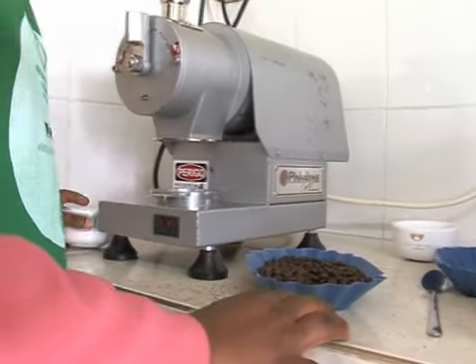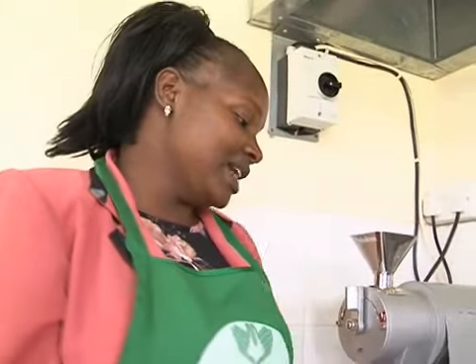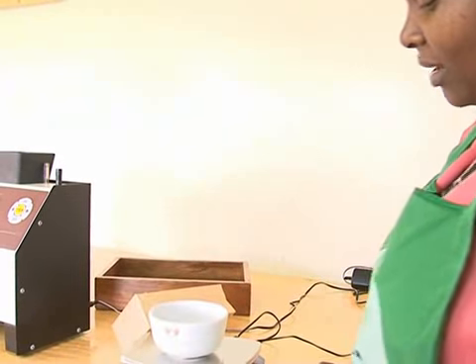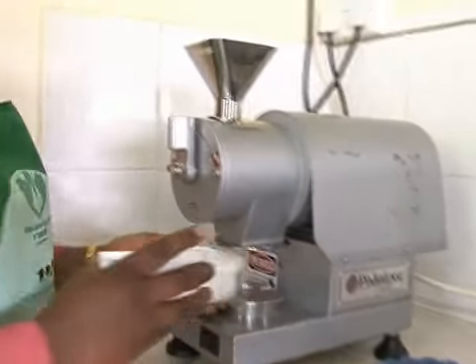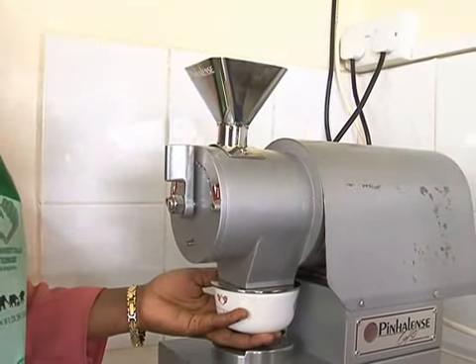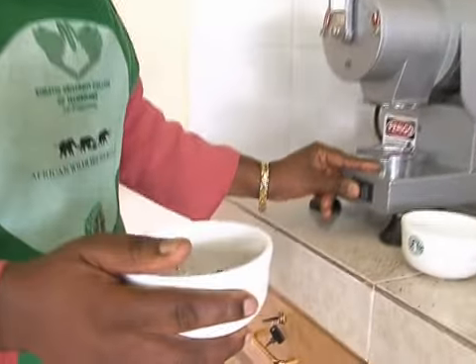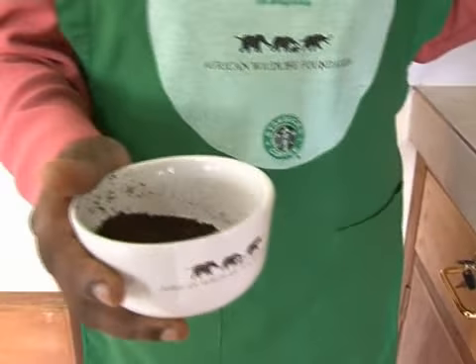And for cupping, you just get 11 grams. So you just take the weight here. You put 11 grams, and after you put 11 grams, you grind the coffee. This is the coffee that is from this grinding machine.